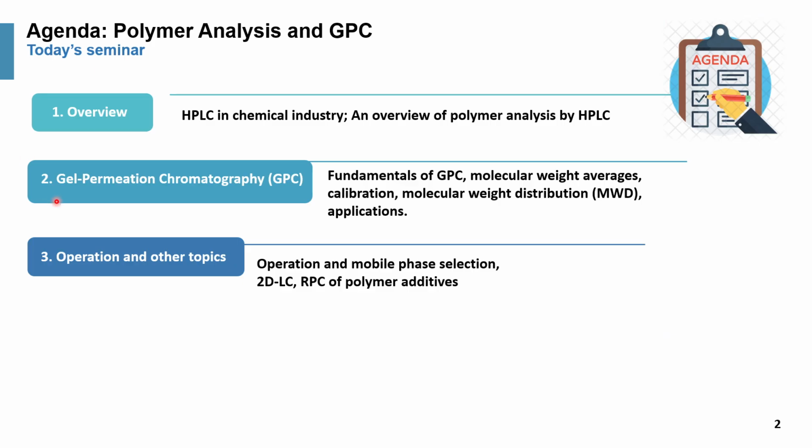This is my agenda. Three different sections. First is overview, mentioning also about chemical industry in addition to the polymer industry. Second is a fundamental summary of GPC, gel permeation chromatography, talking on fundamentals, molecular weight averages, the calibration process, something called MWD, standing for molecular weight distribution, and several applications.